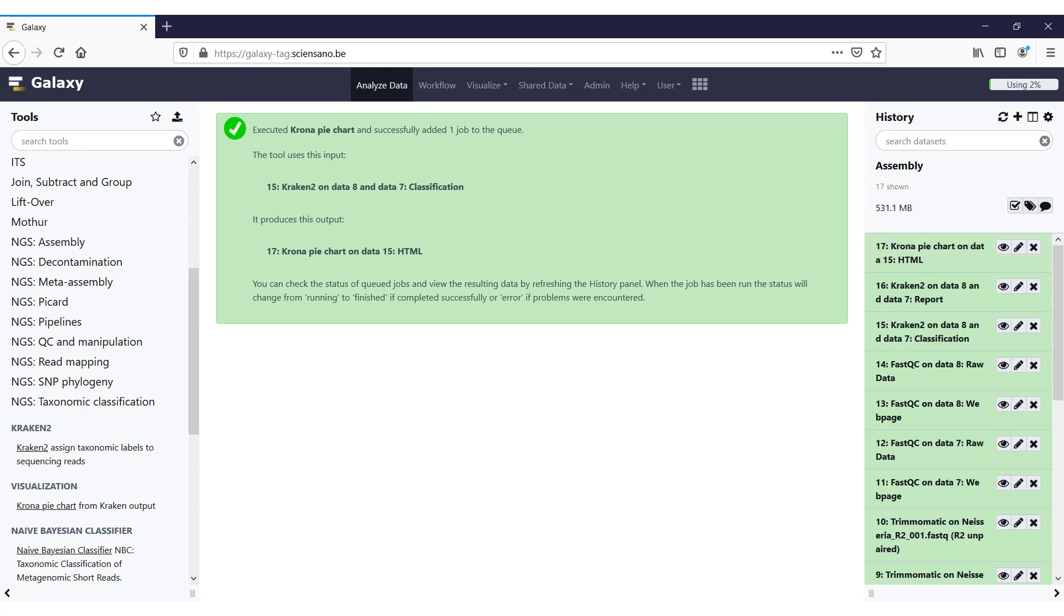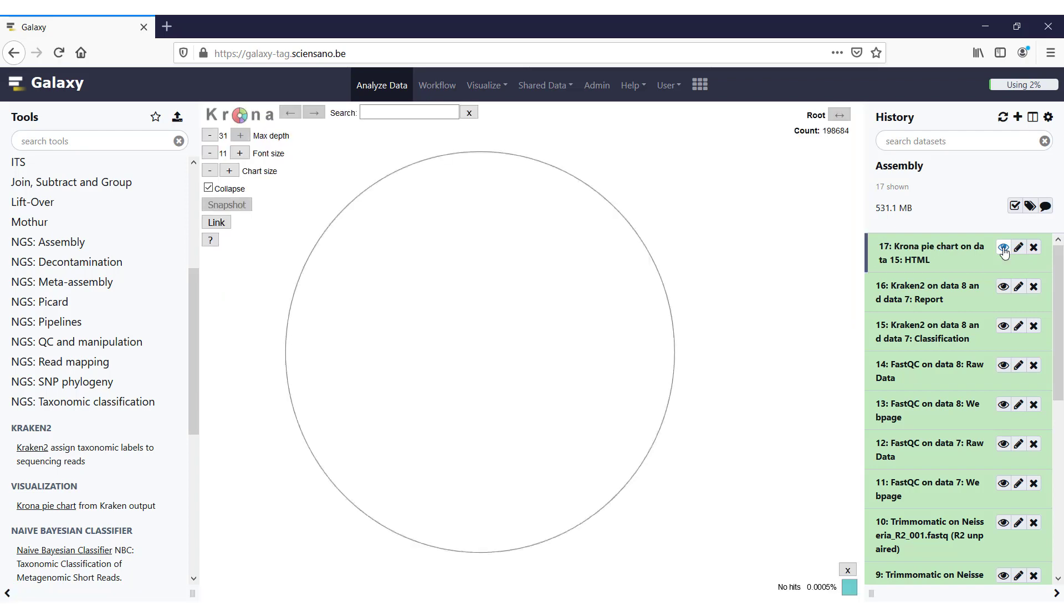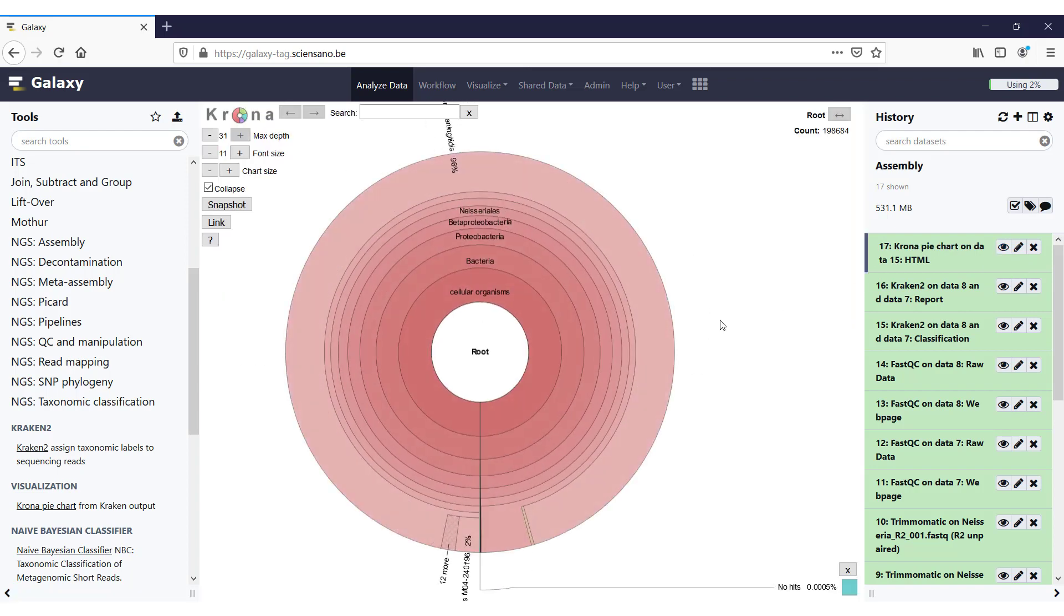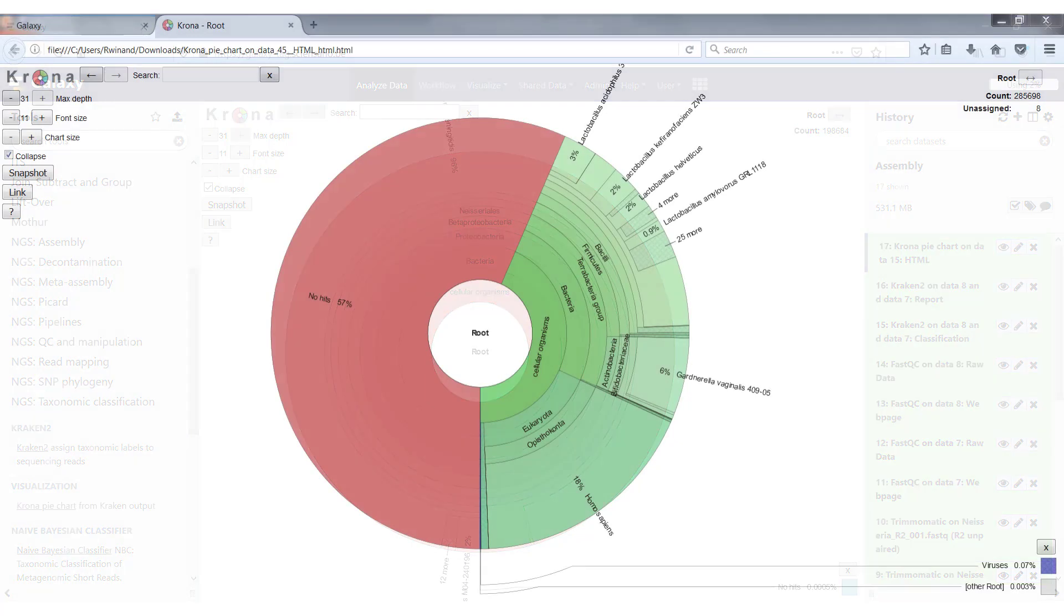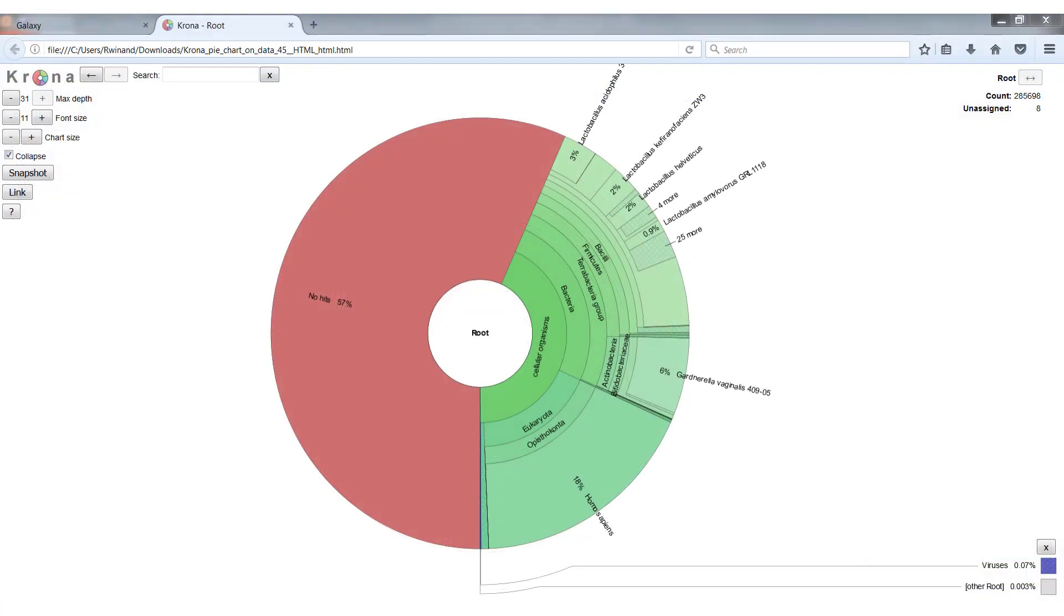So Krona has finished running now, and you can just open the interactive visualization by clicking on the eye icon on the output data. To show you what you can do with Krona, I have loaded a chart from a different sample. So you see that in this case, we had 57% of sequences that could not be identified by Kraken. In the other half, we find a number of bacteria, eukaryota, and a small number of viruses.